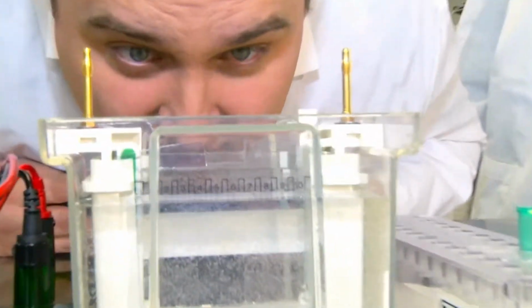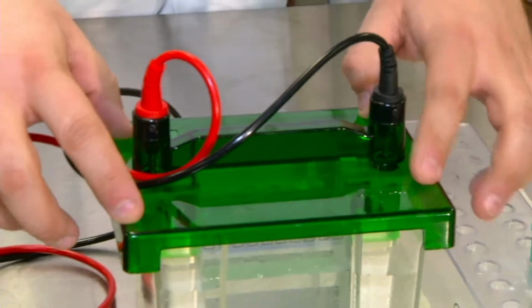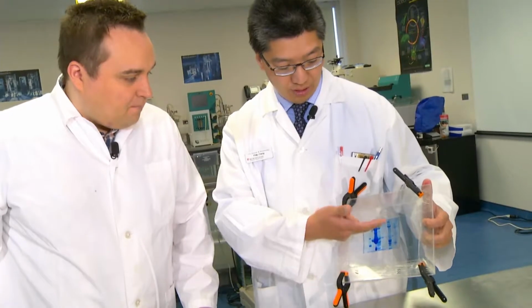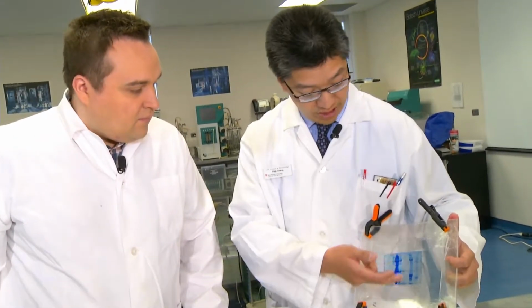Once we have loaded the sample, then we would apply an electrical charge to it. In the industry, what we need to do is find out exactly what is in the product that we're making. So it takes a little bit of time. It does. And then you end up with this. What you're seeing is the separation of proteins in the sample. For example, this particular lane here represents a fish sample.